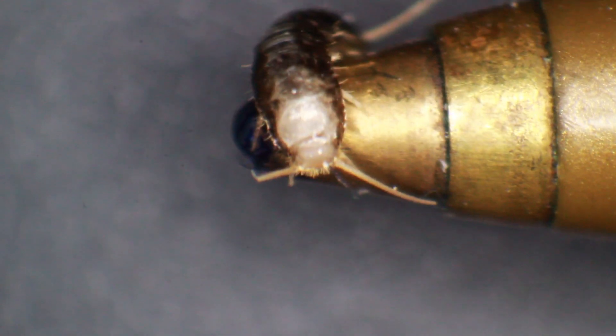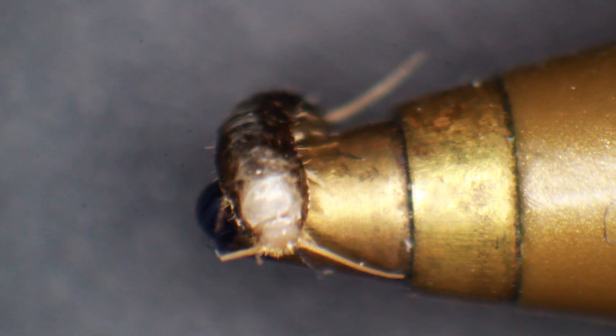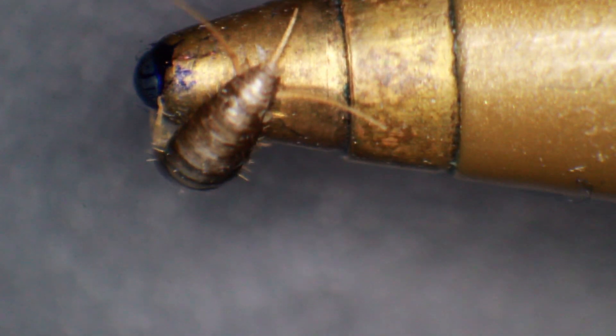They have a fish-like appearance because they look silver and are so flat, but of course they are insects. When they hatch they are white, but later in their life they turn silverish-grayish and start to shine a little bit. I'm trying to turn the pen around so I can see the head better.